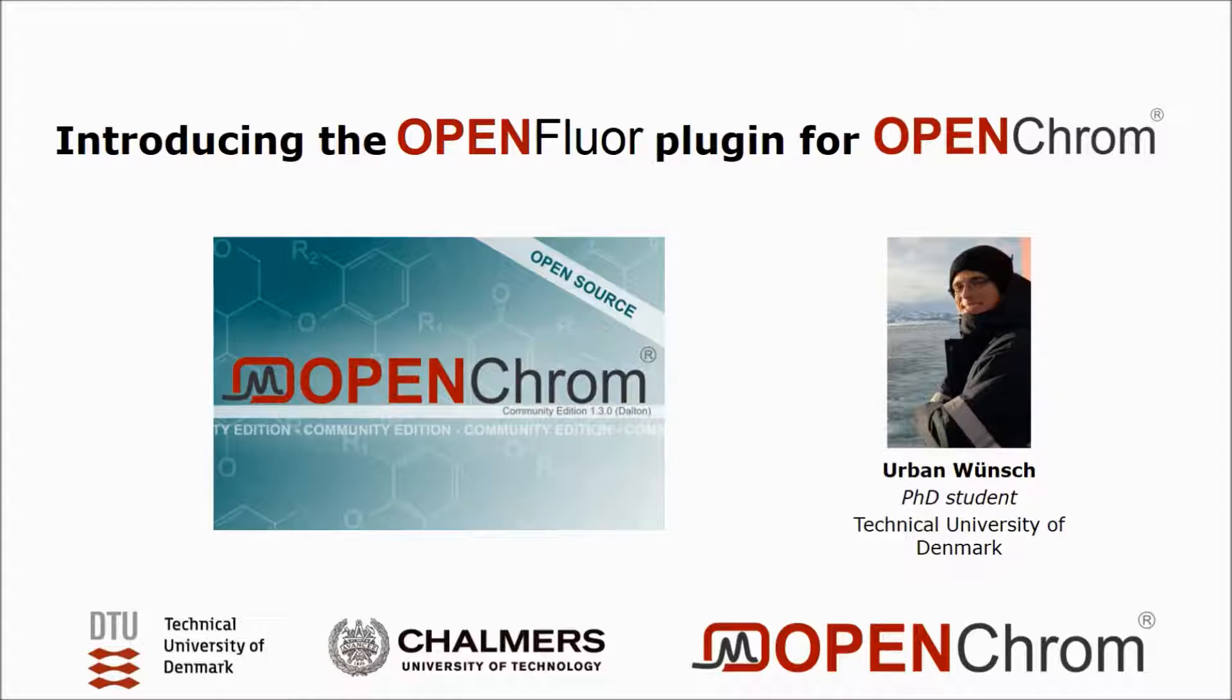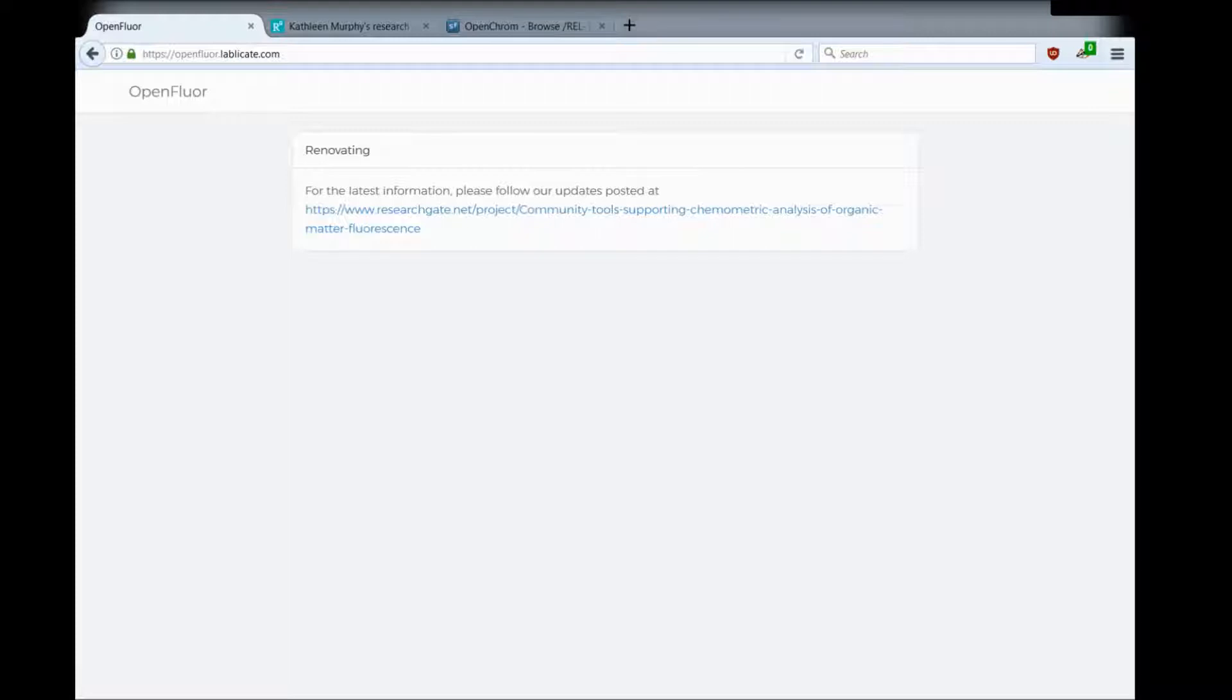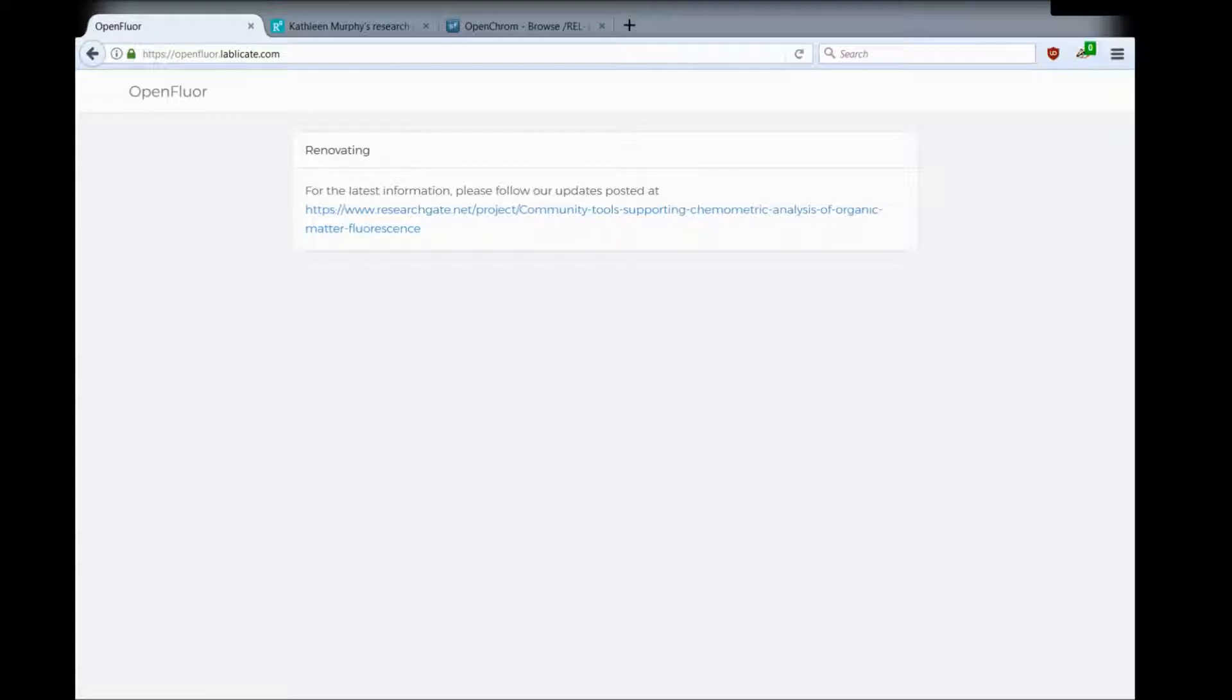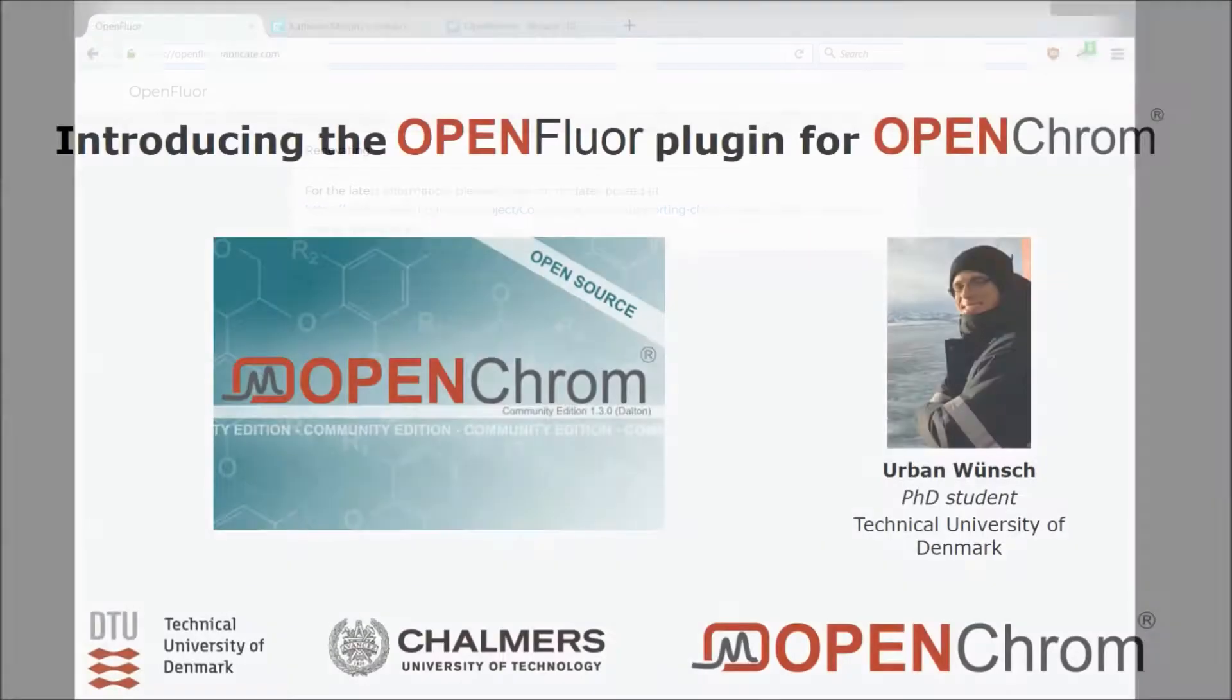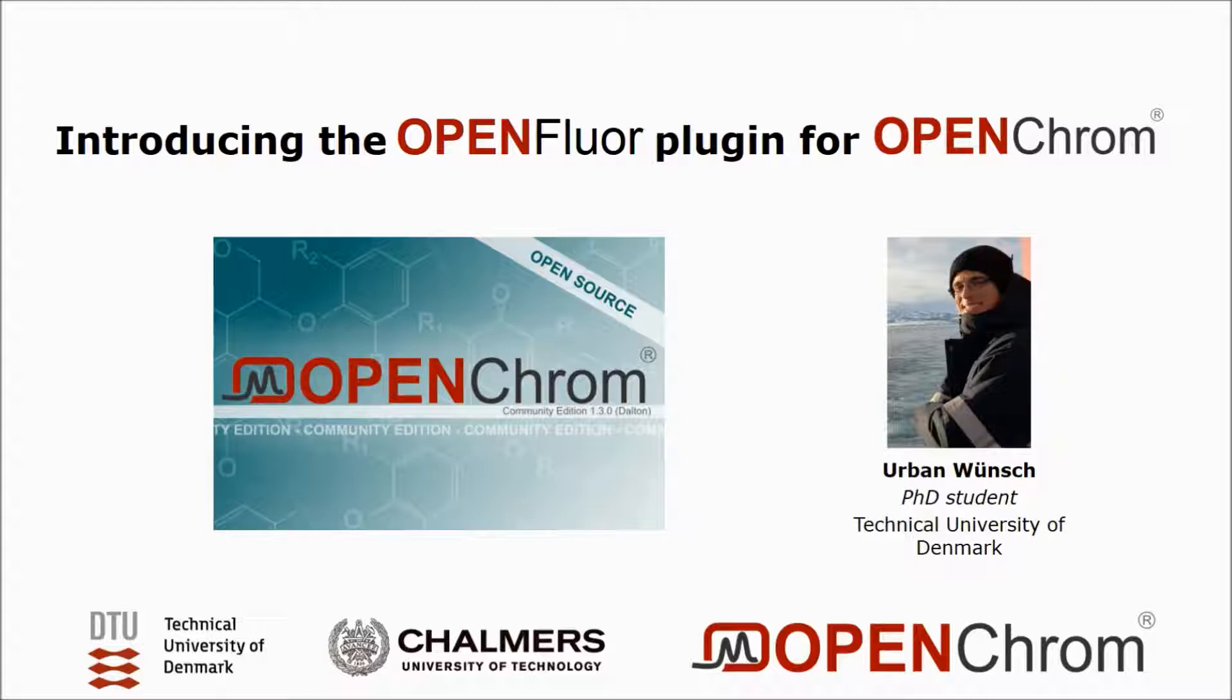As you are probably well aware of, the website openfluor.org, you can see here, is still not finished renovating. We're still working on an online solution for OpenFluor that works again because we've had server issues in the past. We're currently migrating and renovating OpenFluor in the process, which is taking some time, but we are working on it and there will be an update so that OpenFluor is back online. In the meantime, we've been working on OpenFluor as a plugin for OpenChrom.